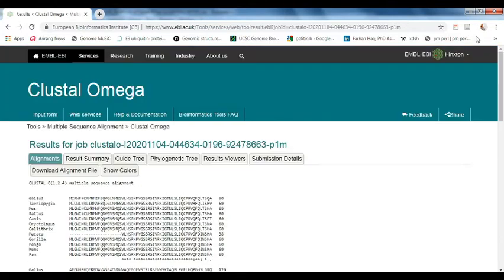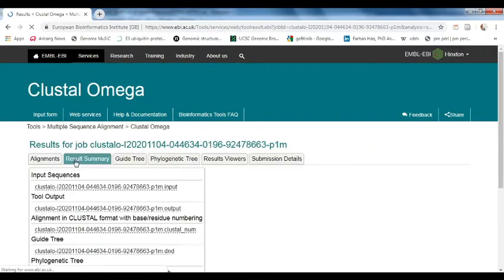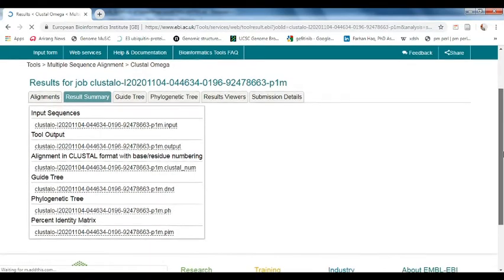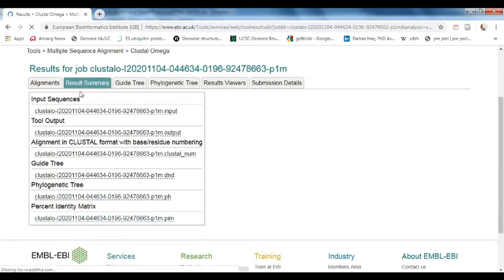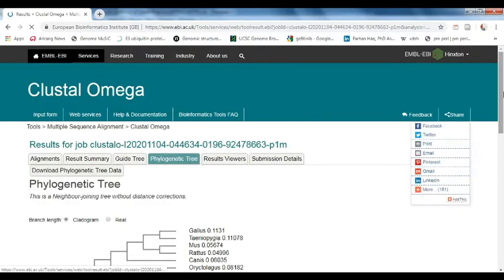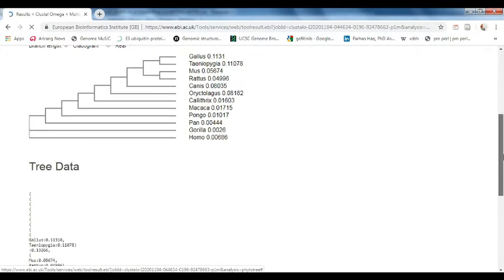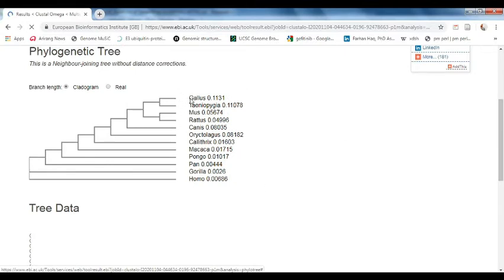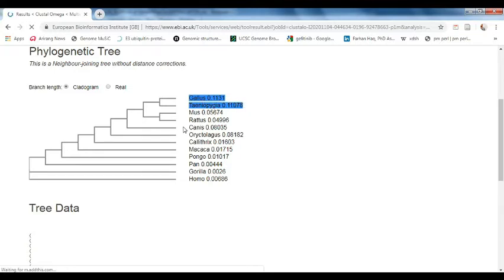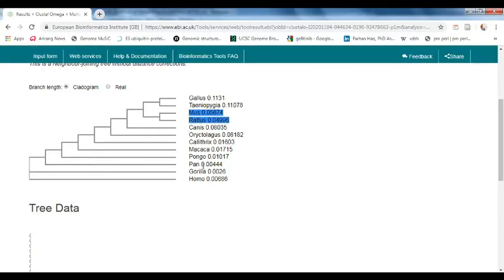You can see there is a highly similar region from start to end with slight variations. If you want to view the phylogenetic tree, you can first check the results summary — all summaries are available including alignment in ClustalW format and the phylogenetic tree link. In the phylogenetic tree, sequences are clustered based on alignment scores. Birds — Gallus and Taeniopygia guttata — cluster together, rodents cluster together, and the primates are closely linked compared to other species.